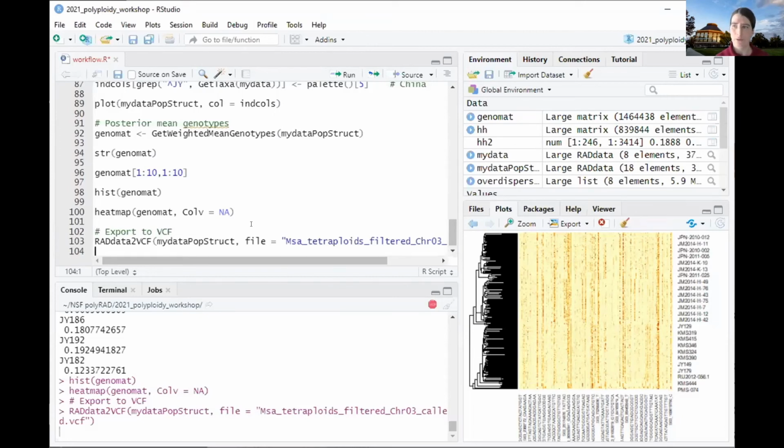Right, and if the PCA is derived from 10,000 markers and you're only looking at one marker, then the prior is slightly influenced by that marker, but mostly it's influenced by the rest of the data set.